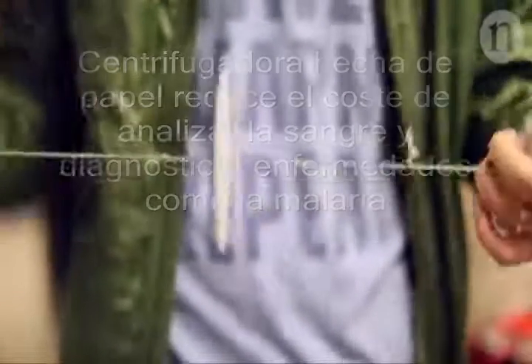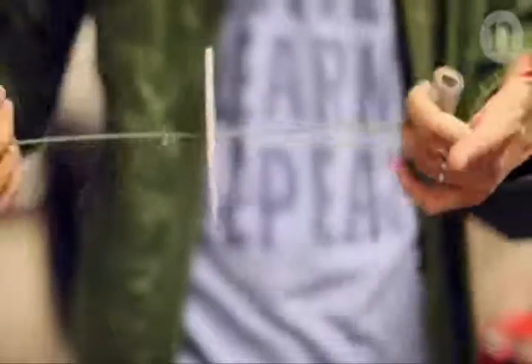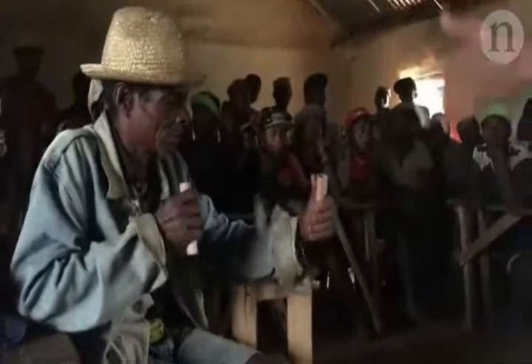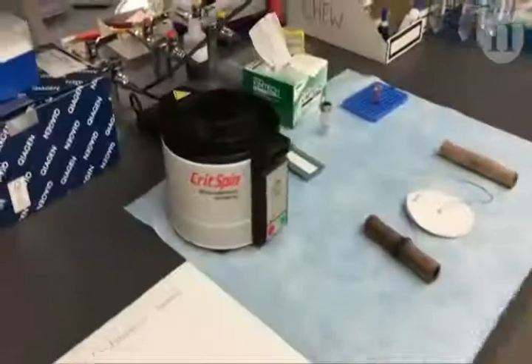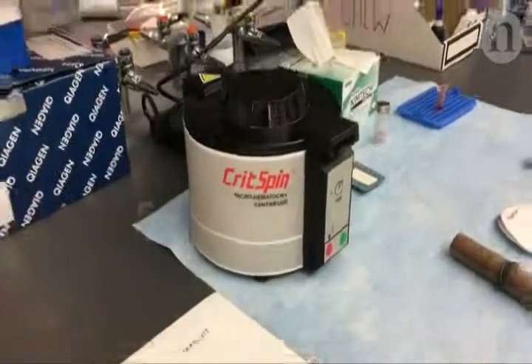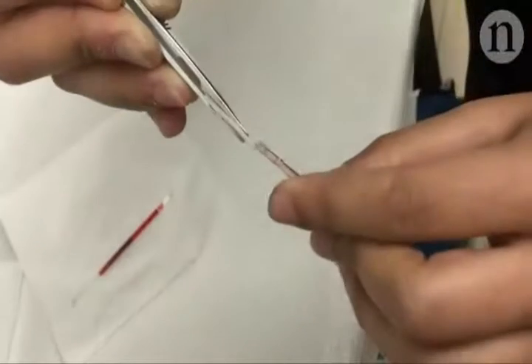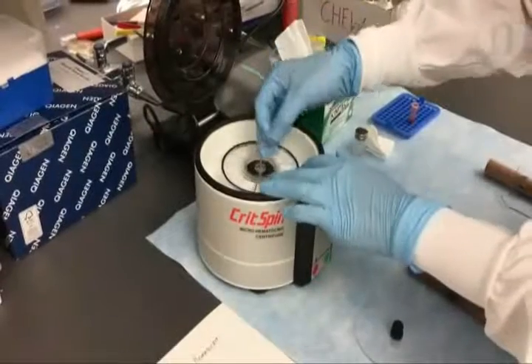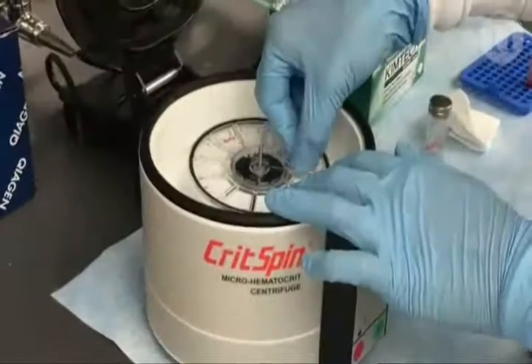Scientists have used paper and string to make a centrifuge that could be used for medical tests in remote locations. The centrifuge is an important part of science labs across the world. In healthcare, you need one to separate blood into different parts for further testing. But centrifuges are traditionally bulky and expensive and need to be plugged in.